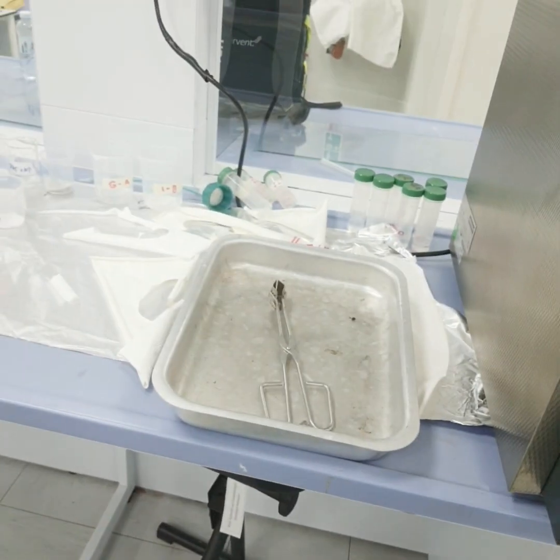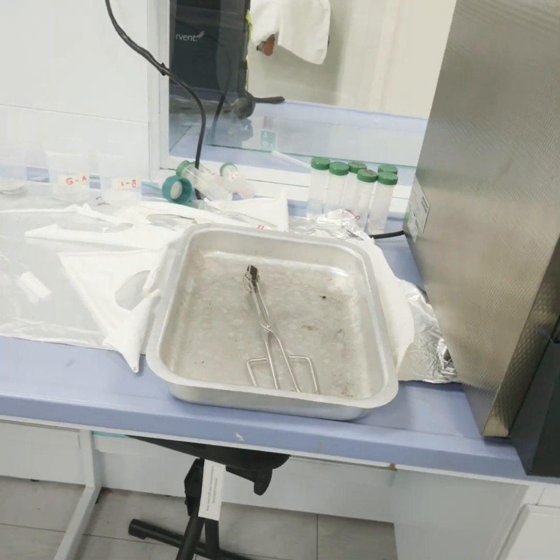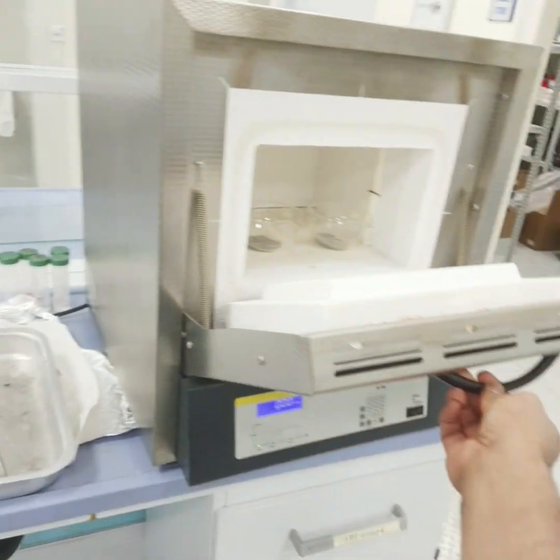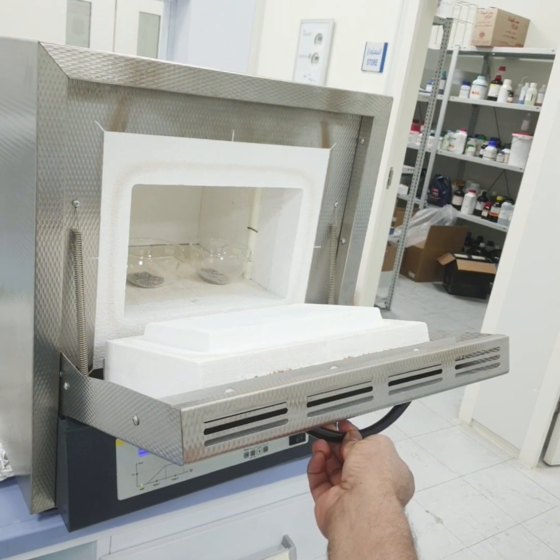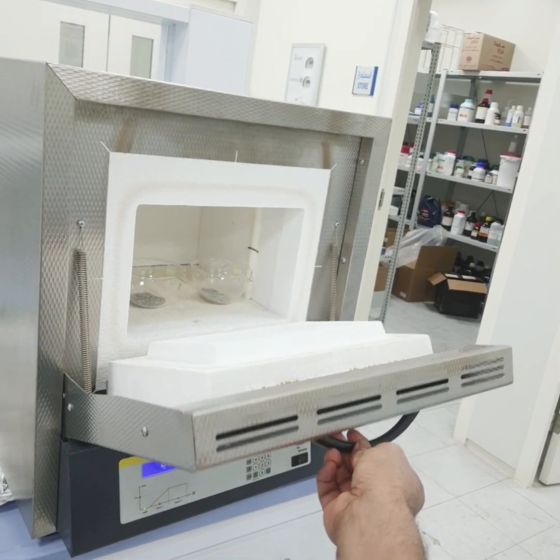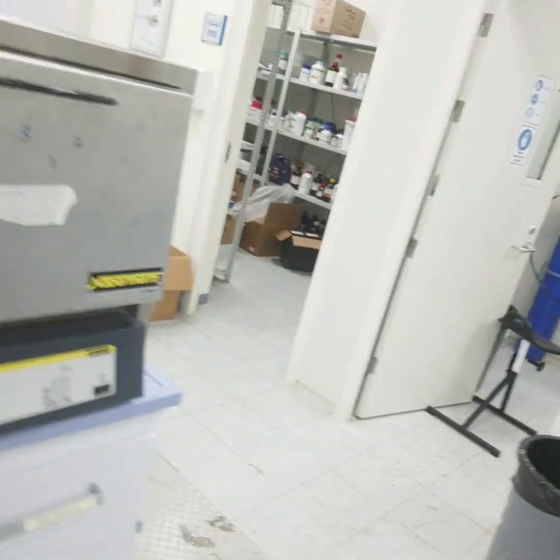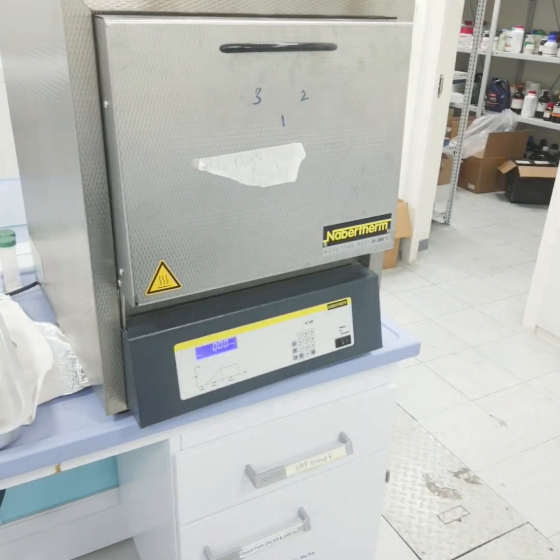Now we take out the burnt biomass, then cool it and wait. For cooling we will use a desiccator as we used in our last videos.